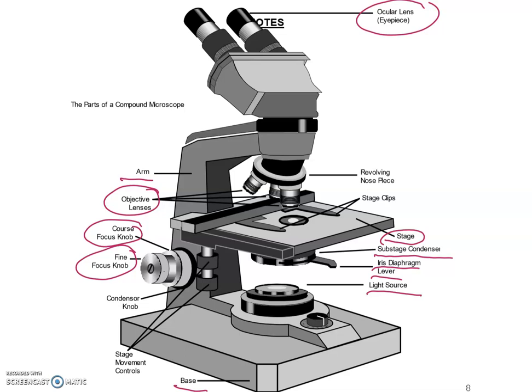So let's pick it up where we left off on the previous recording. Just here briefly again, the image of a microscope, a standard binocular microscope. The parts that you should know are the two ocular lenses up here. Then the portion where you're carrying the microscope, that would be the arm, is always supposed to support the base as you're carrying a microscope.